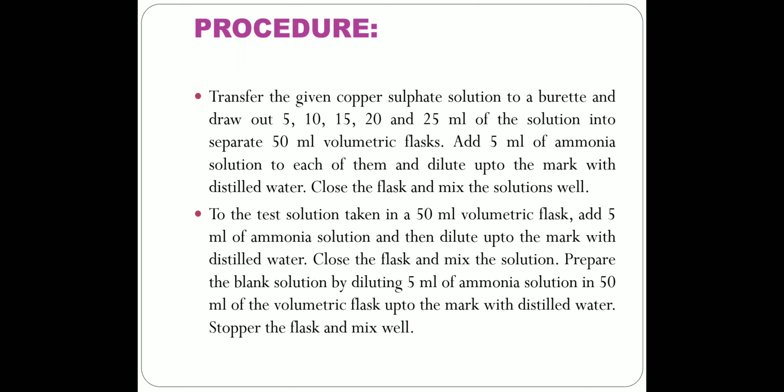Afterwards, we keep on increasing the concentration of copper sulfate like 15, 20 and 25. Ammonia will be in the same volume, that is 5 ml, and then all of them will be diluted with double distilled water and the solutions will be made up to 50 ml volume.